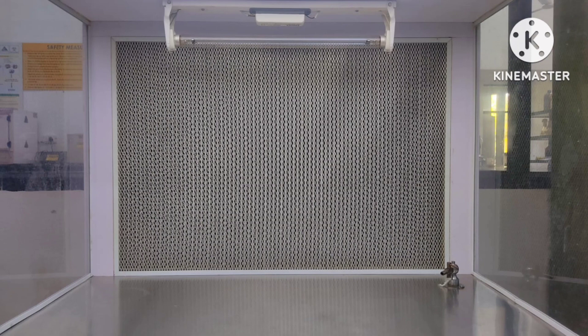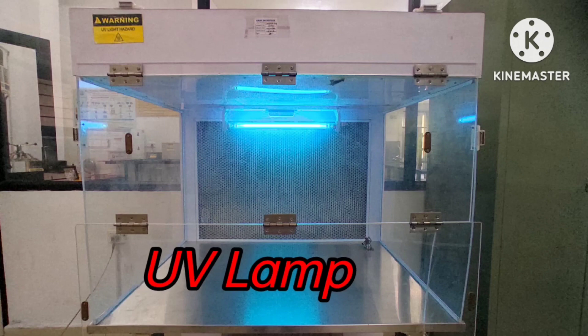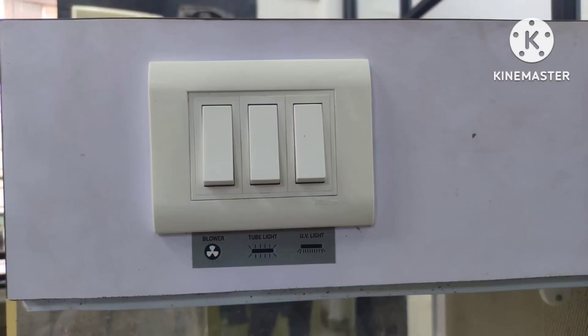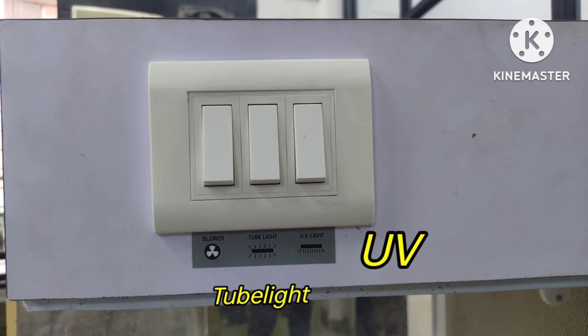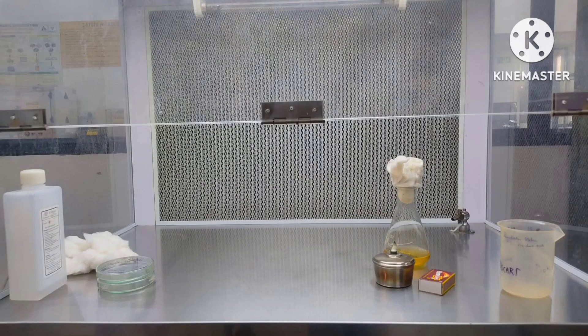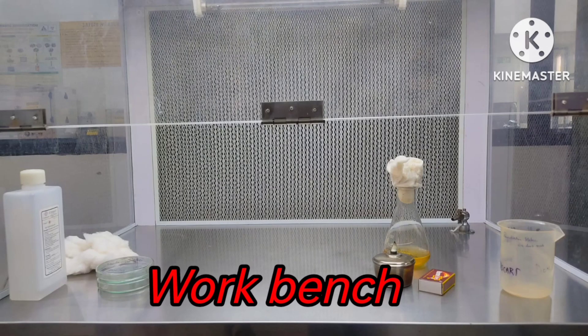The UV lamp provides ultraviolet light, which is carcinogenic in nature — it causes cells to grow unnaturally and destroys living protein. Next, we have a set of switches for the blower, tube light, and UV light, used according to our purposes. We also have a manometer, which is used to measure the pressure inside the laminar airflow cabinet.